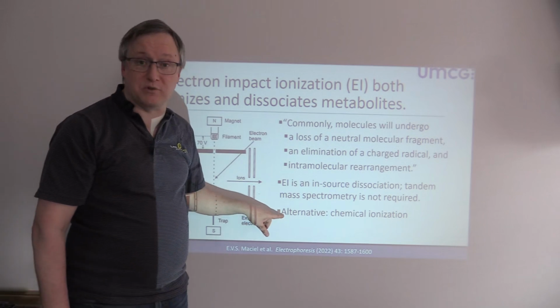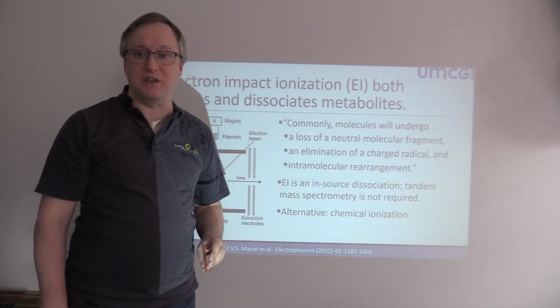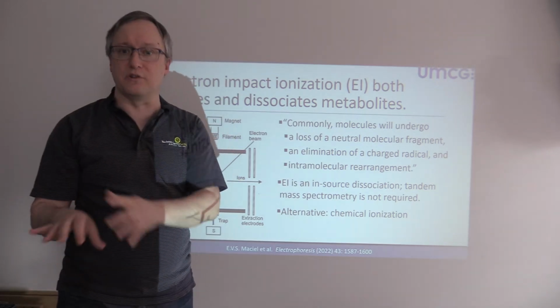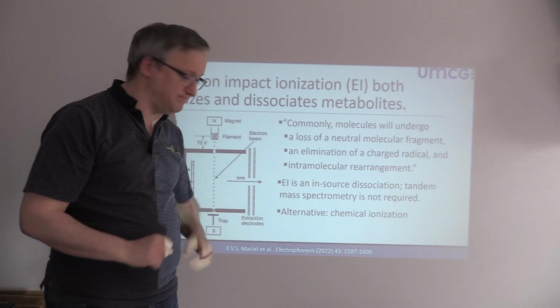Now that's not the only option. We do have some chemical ionization methods, but it seems that the GC-EI-MS approach is really the most common that you'll see.